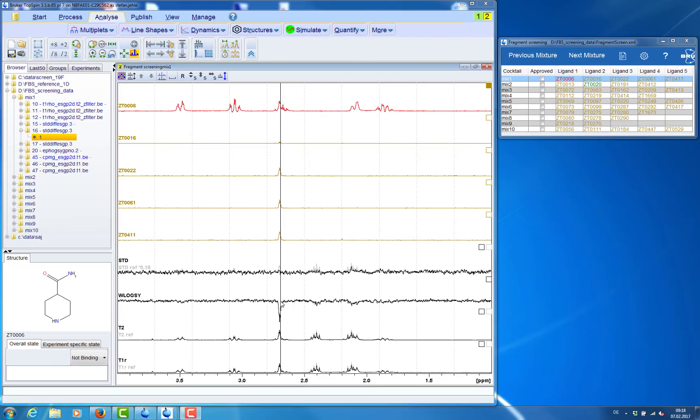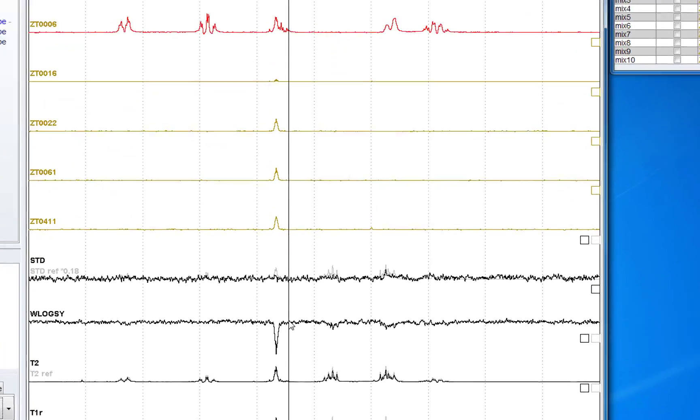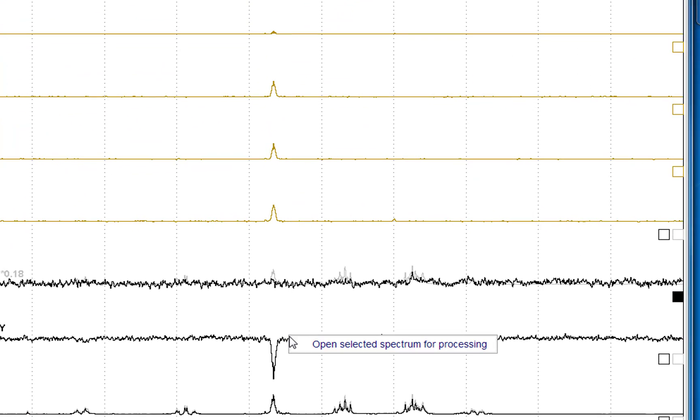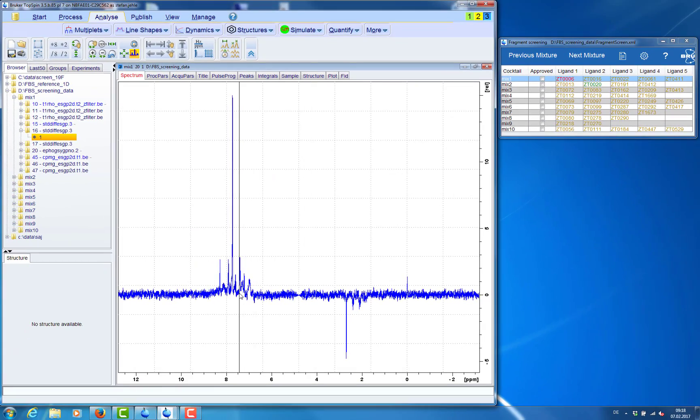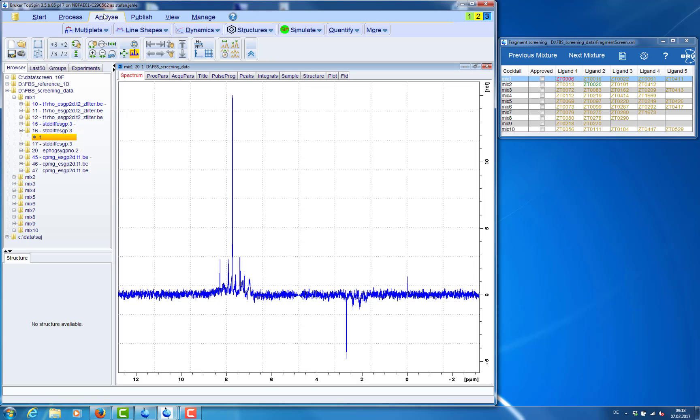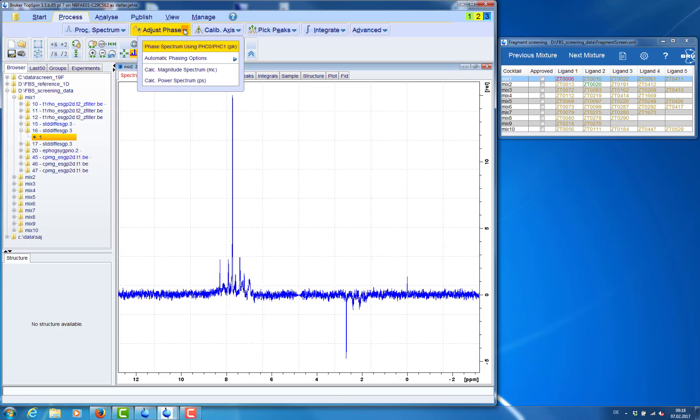Reprocessing of screening spectra is really simple from within the tool. We select the spectrum, right click and then we can follow the link to the original spectrum.